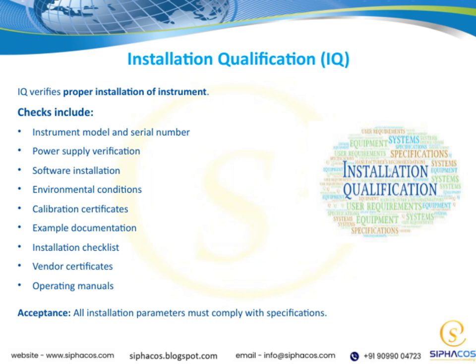We also verify the power supply to make sure it's stable and meets requirements. Software installation is another vital point, checking that the software is properly installed and configured. Environmental conditions are also assessed, because factors like temperature and humidity can impact performance. We review calibration certificates to ensure the instrument is calibrated and ready for use.